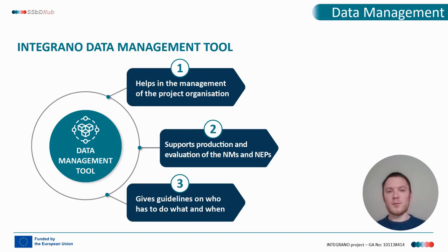At the same time as helping us with the management of the data, we wanted the software to also help us in the management of the project, including acting as a tool in the production and evaluation of the nanomaterials and nano-enabled products. So for example, helping us identify which partner does what and when will the samples be delivered, and what stage is the work at.